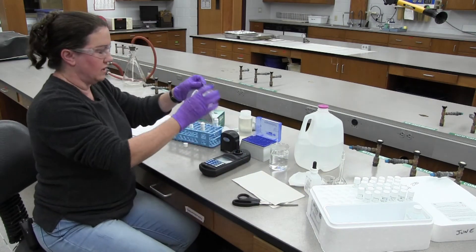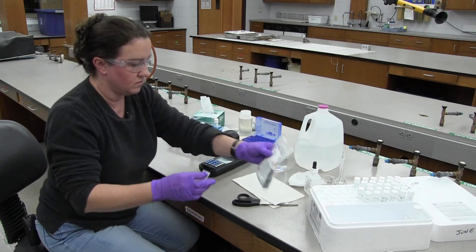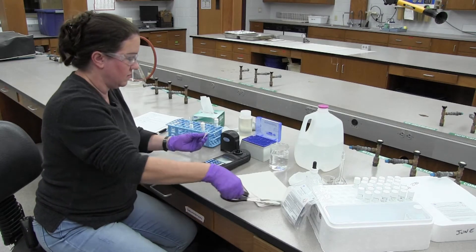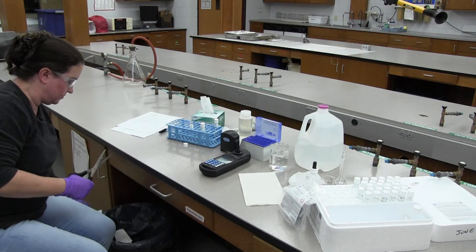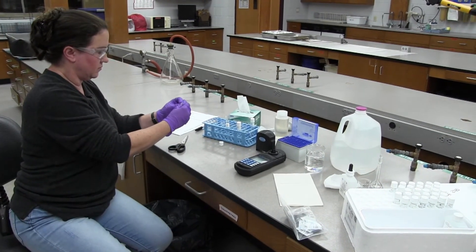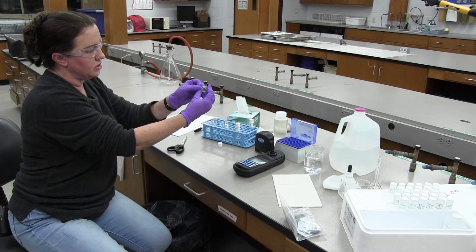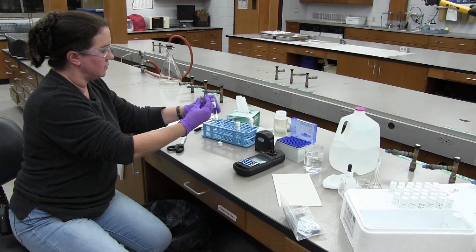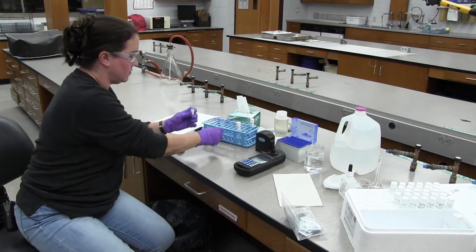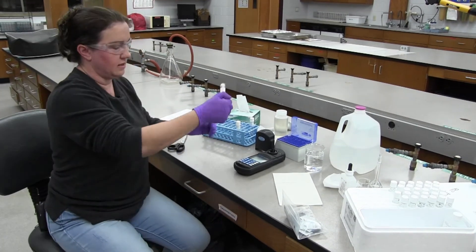I'm going to add one of my PhosVer 3 powder pillows. Let's knock all the powder to the bottom. I've opened the powder pillow and I want to push the sides in so it will open, then add it to the vial.